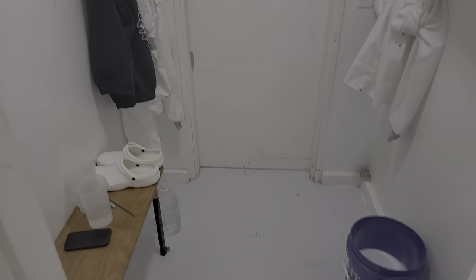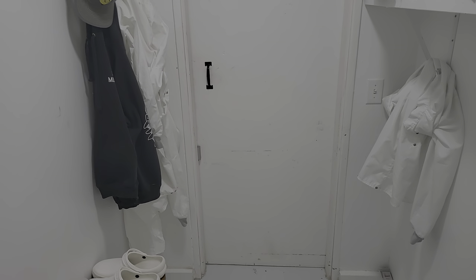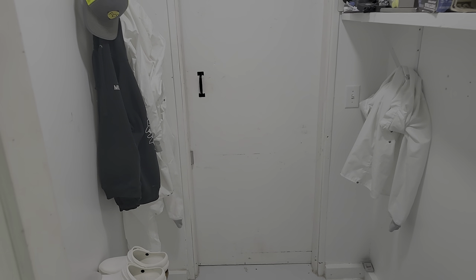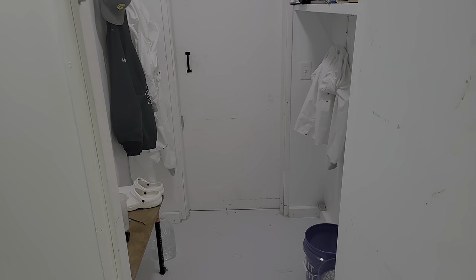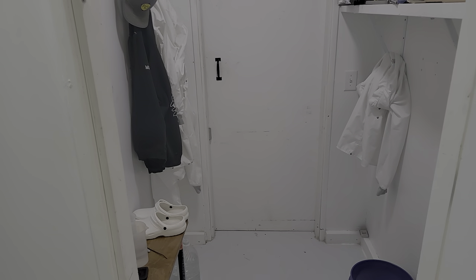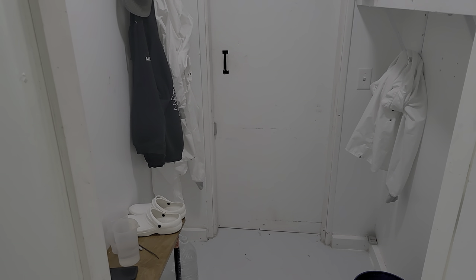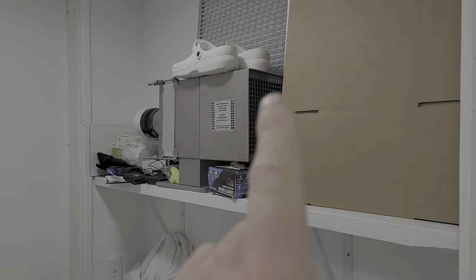I'm actually in a clean room suit right now. We make sure that we leave our dirty shoes outside in the hallway and then change into our clean clothes. Every time I come in here I am fresh showered, with fresh clothes out of the wash — not grabbing from the dirty laundry pile.